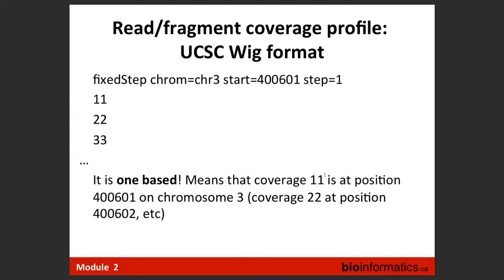Now, another important visualization format is the WIG format, to visualize exactly those coverages. It's done in order to visualize those coverages in a compact way. We will talk a little bit about this during our tutorial. We actually generate this file. Hopefully we'll have time for this, and maybe let's talk about this format later. This is a very unusual format for us.